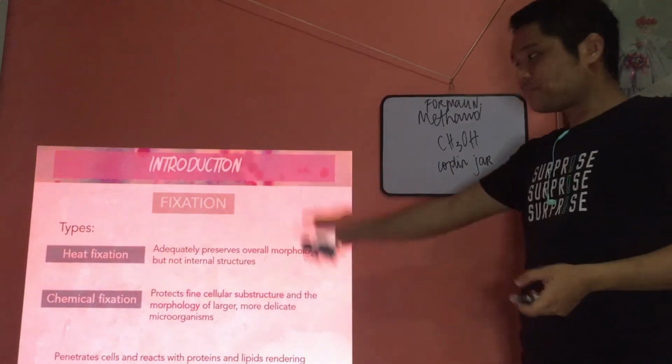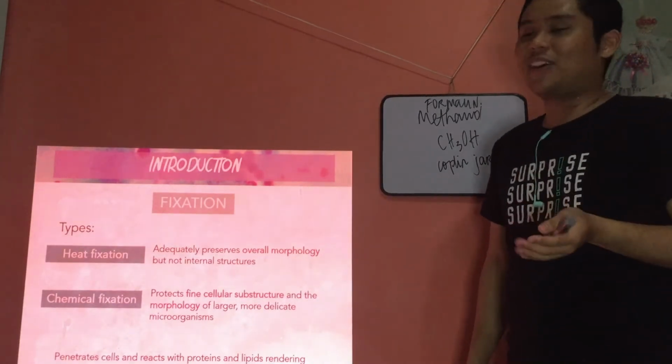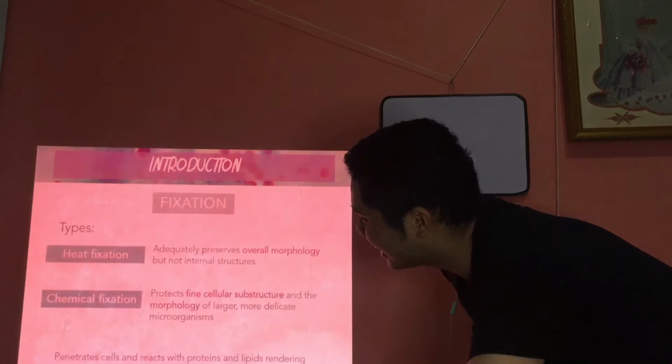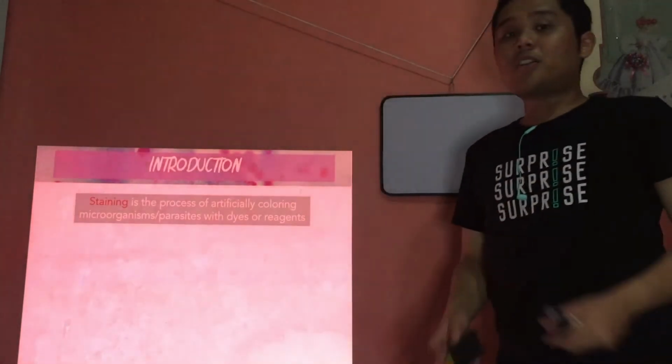Okay, alright. So generally the fixation kills the organisms. Alright, that's my point. Okay, so that's for fixation. Okay, next, we now go to the process of staining.